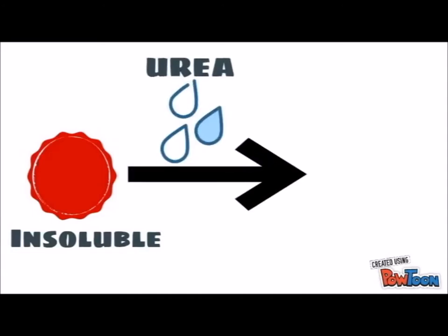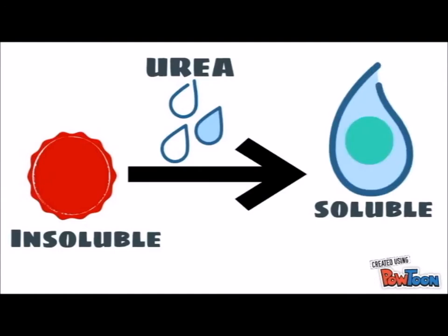If the GST tag protein is not soluble in the recommended native buffer condition, or does not bind to the glutathione affinity matrix, we can destabilize the conformation of the GST tag protein by adding the denaturant urea. Up to 4 molar urea has been successfully applied in lysis and binding.